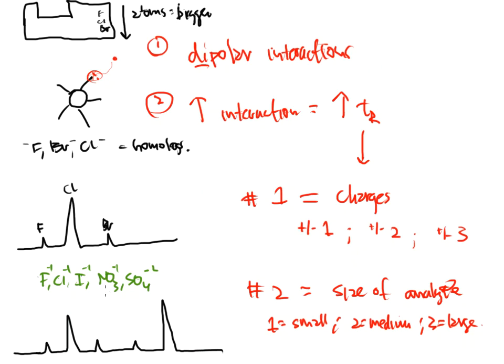So here are my -1s. The smallest one here is fluoride, then chloride opens up, then I get iodide, and then the nitrate. Which one's going to come off next? Remember, smaller ones come off first. This N and the O3, that's 16 times 3 plus another 14. Is that bigger than the iodide? Not really. So you'd probably put NO3 here and then I there. Sulfate's a -2, so sulfate will come off last. So the answer is you almost have it here.